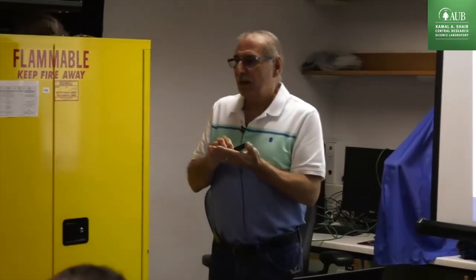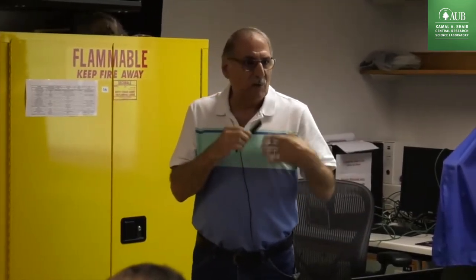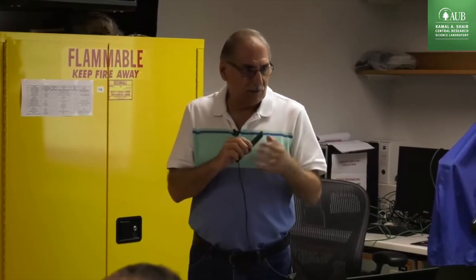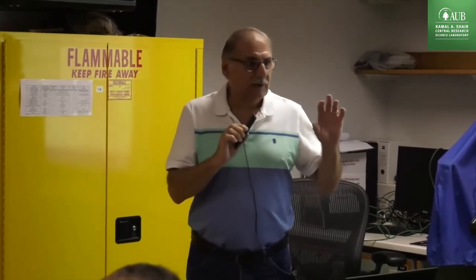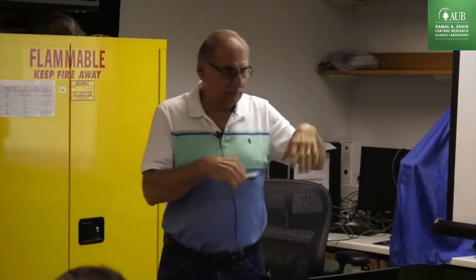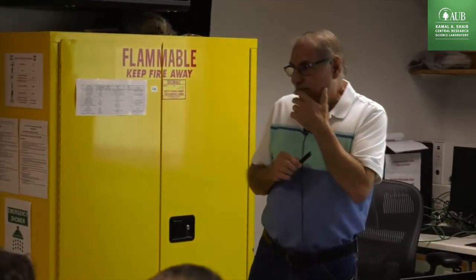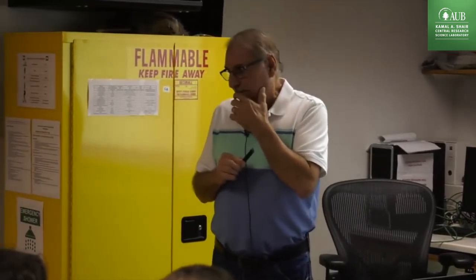You just flow oxygen, and the oxygen will react with the carbon and give you CO, CO2. And you can even quantify the amount of CO you're getting. So you can adjust your reaction to promote or de-promote the deposition of carbon, so you get less carbon. In the case of desorption, we're talking about hydrogen. So basically, we remove the hydrogen from the catalyst.